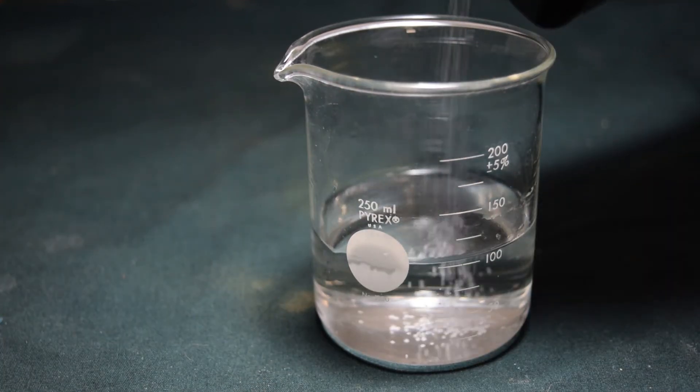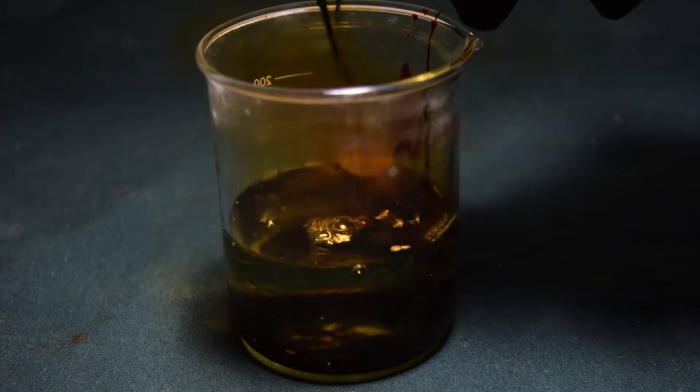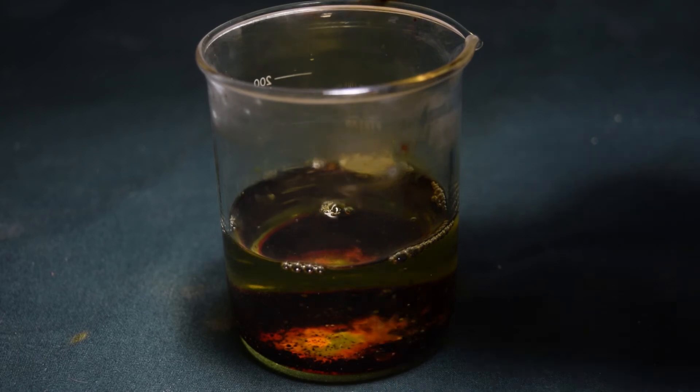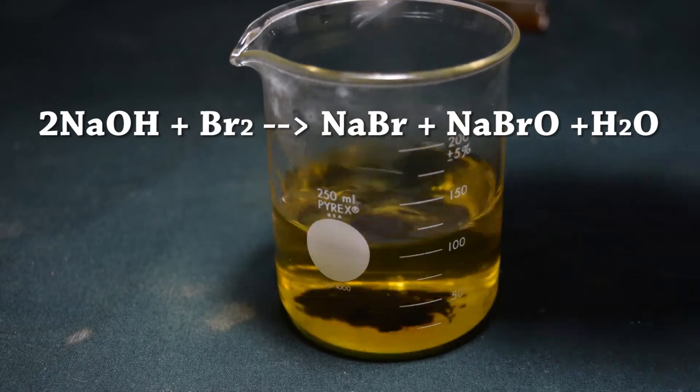First, I'm going to dissolve some sodium hydroxide into water. After that's done, I'm going to add in my elemental bromine. It puts out a ridiculous amount of fumes, so it's a good thing I was doing this in my fume hood. Now I stir this mixture with the pipette for a while and as you can see the bromine reacts with the sodium hydroxide and goes into solution.